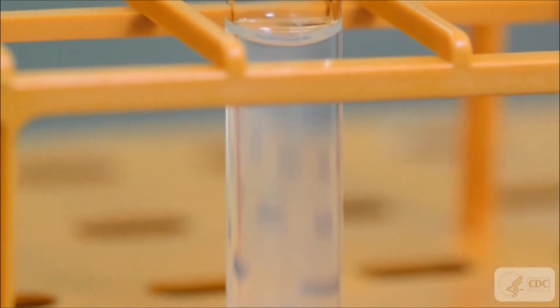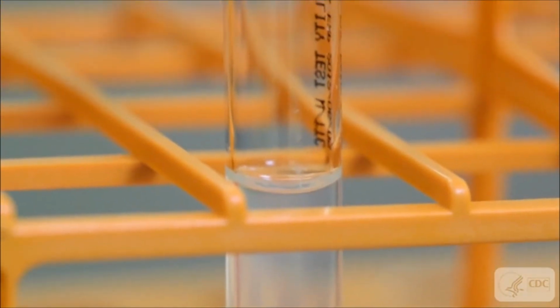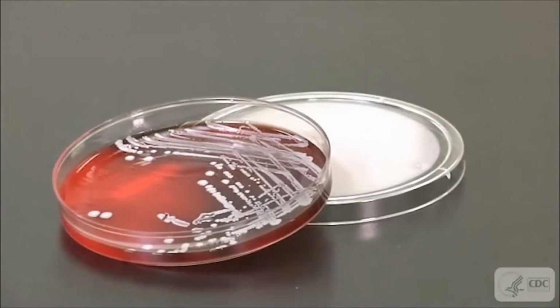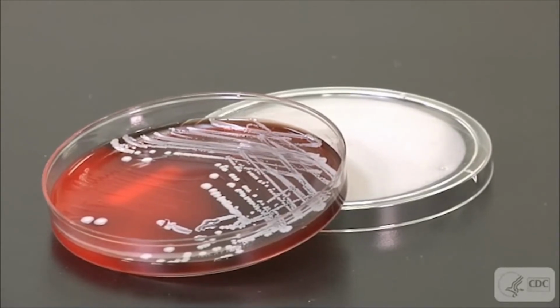Motility media with TTC contains a colorless salt that turns a red color when it becomes reduced as a result of bacterial metabolism. For our samples, we have 2 agar plates containing 2 isolated colony types that are approximately 18 hours old.